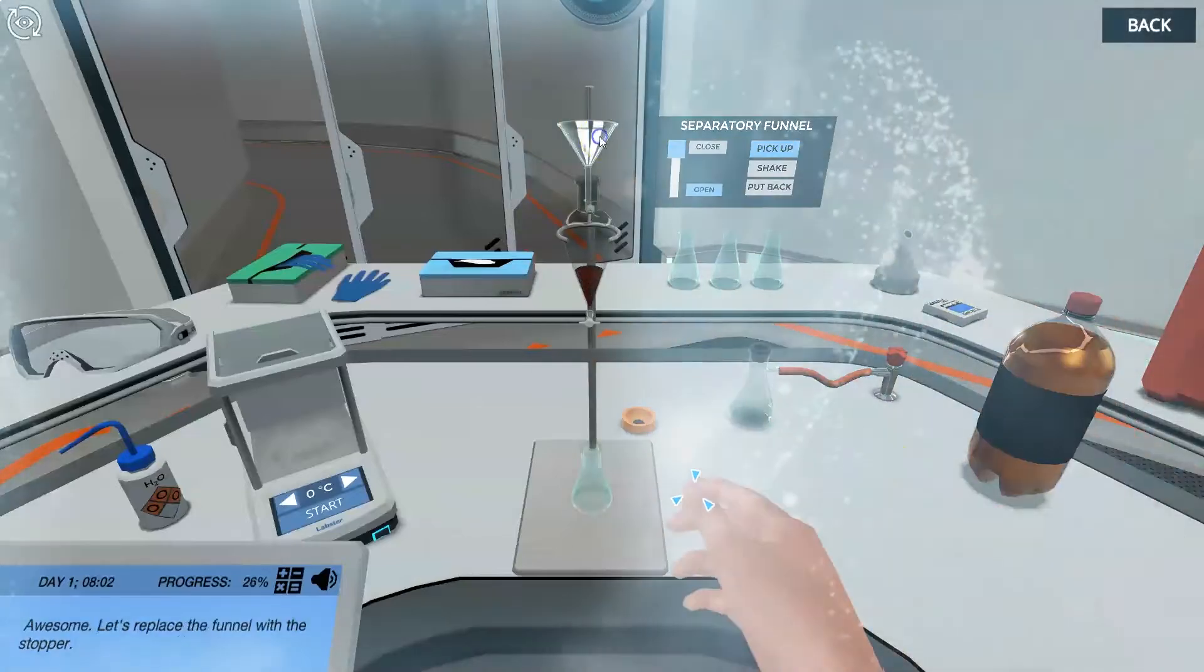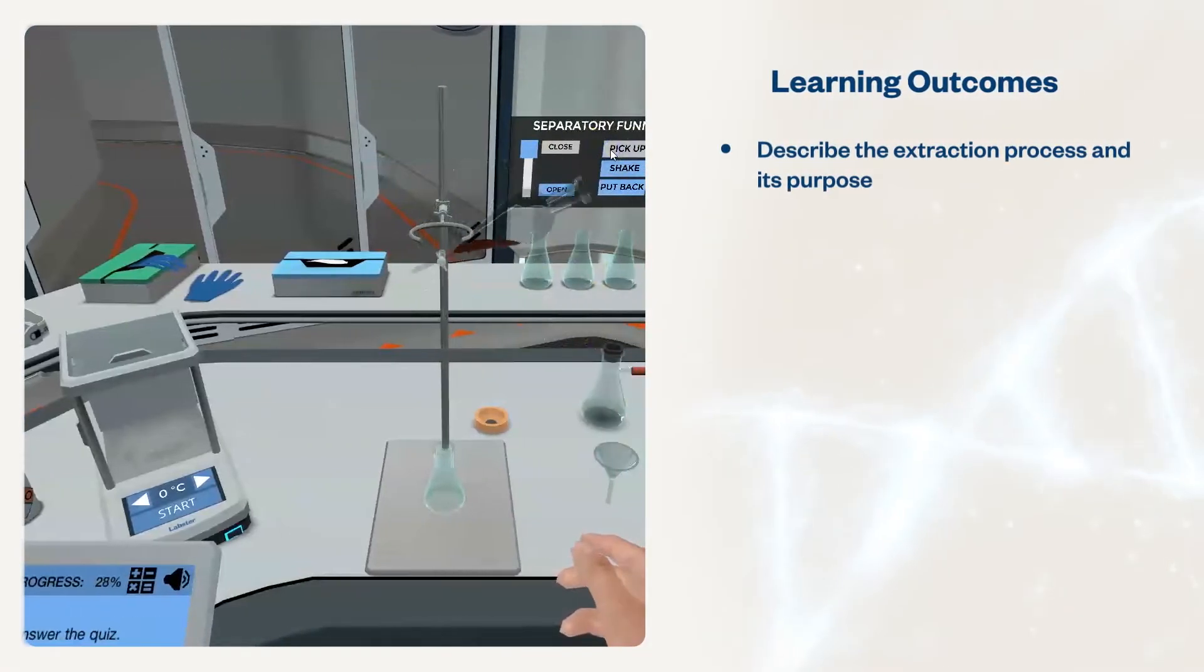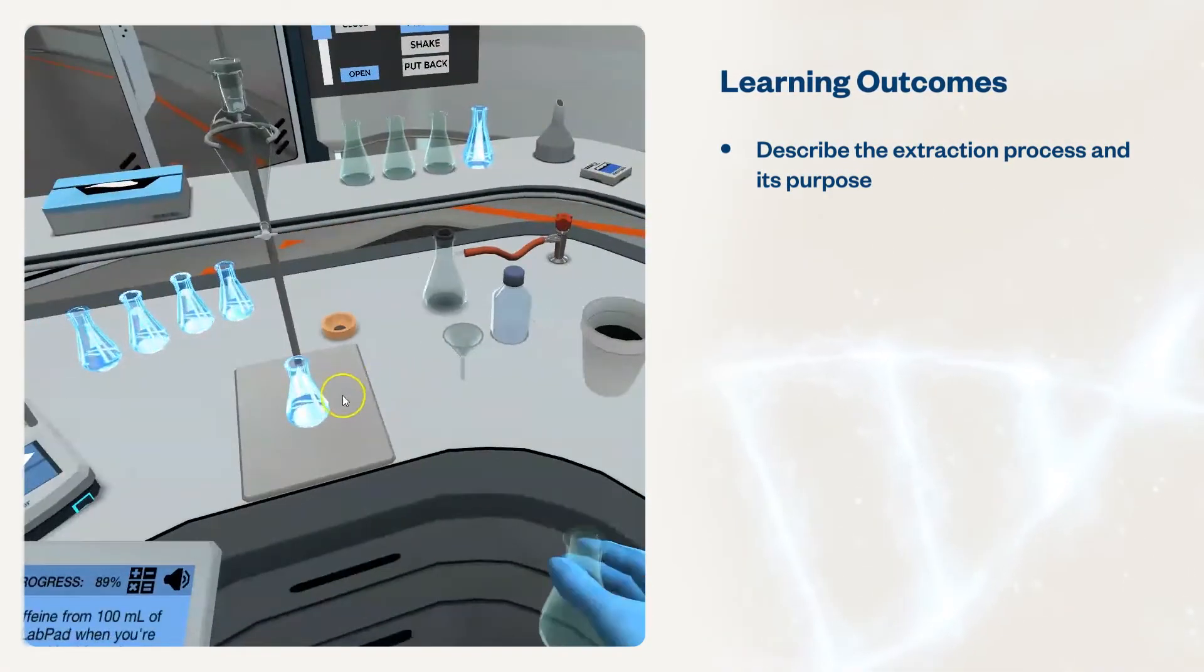These simulations will help students describe the extraction process and its purpose, giving examples of its applications.